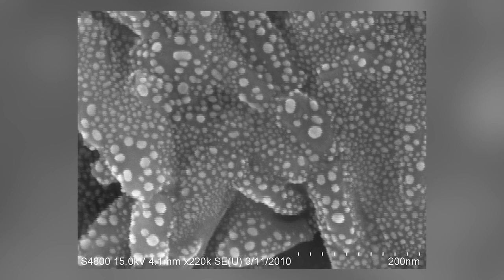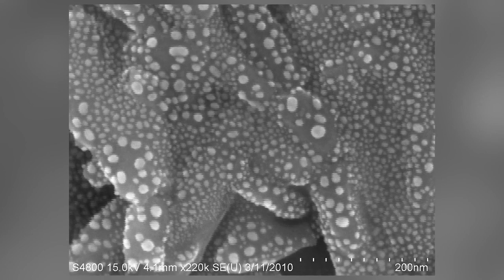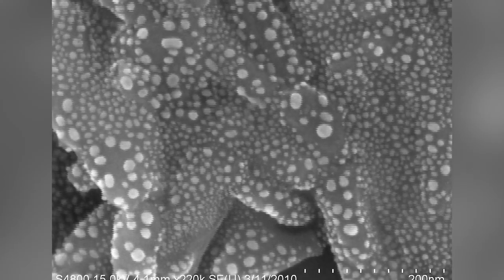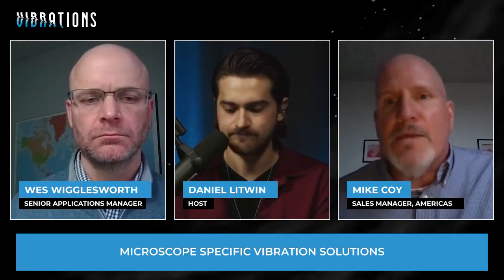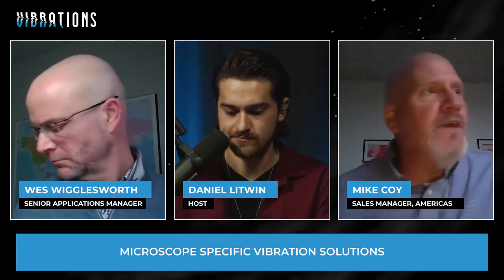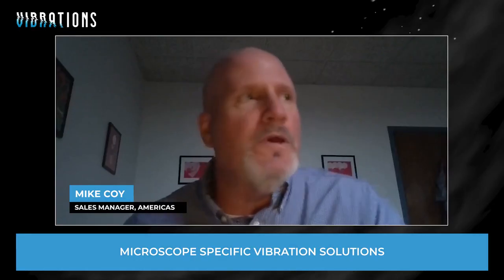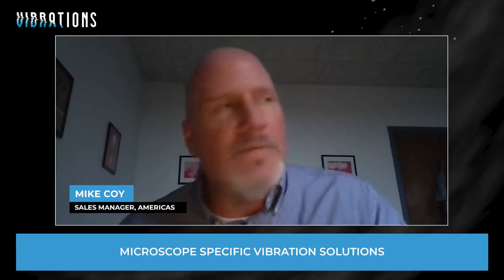You're limited in resolution, or you're limited in magnification, or your image quality simply isn't what you got when you looked at the instrument before. And that's a very quick sign that, wait a minute, something's not right. The instrument manufacturers and their demo facilities obviously have done the utmost to deal with any environmental issues. So they're showing you what you could call an entitlement, right? An absolute performance peak from the instrument. So I think that's the place to start.